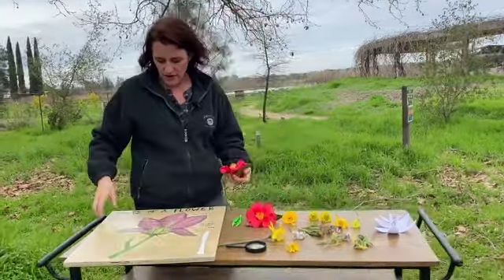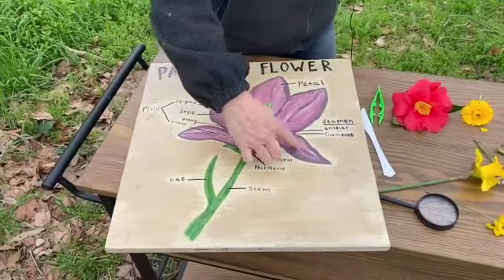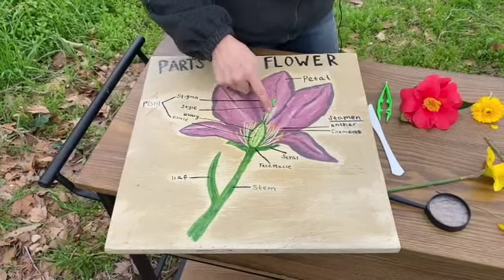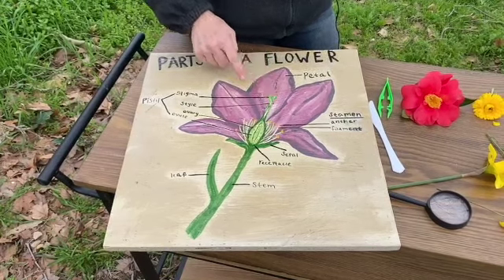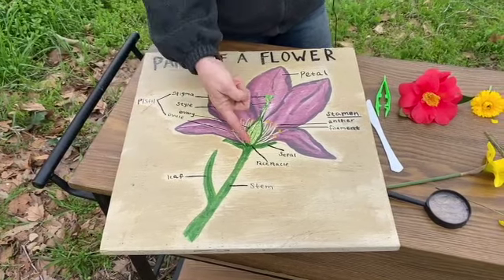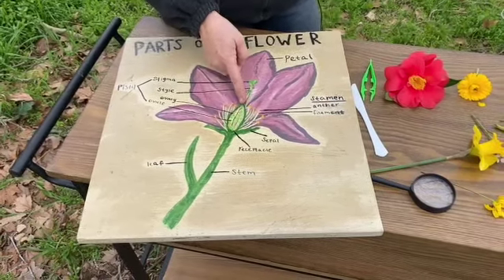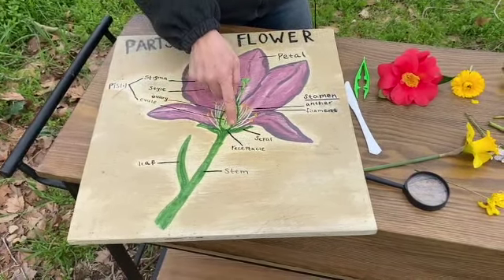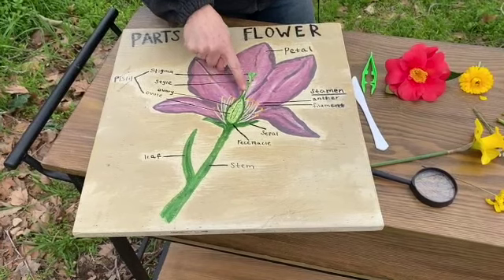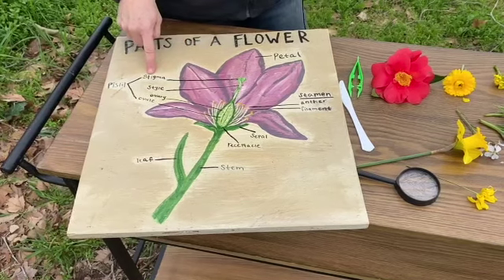Look over at this image right here, which is parts of the flower. And of course, we're familiar with the petals, right? And there's usually somewhere in the flower this longer middle piece, which has all these different parts to it, but the main name for it is the pistil. So it's generally in the center, and it may have a larger cavity down low that's going to hold all those little baby seeds. And then this part of the pistil is called the style. And finally, the top part that might have a small little opening is the stigma.